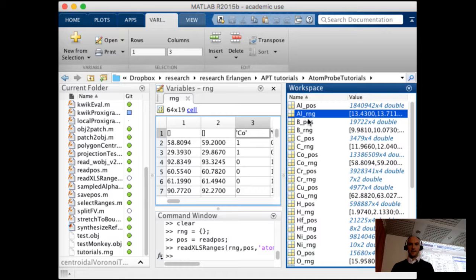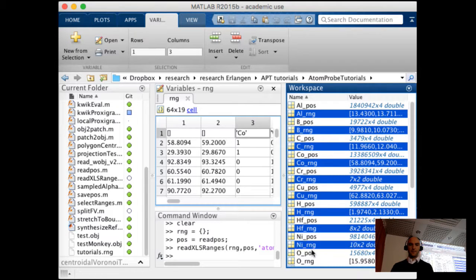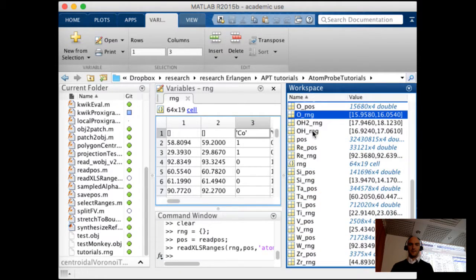Of course, in this case, we're not going to need the ranges anymore, so I might just go and curb them, which we could potentially do in the program.